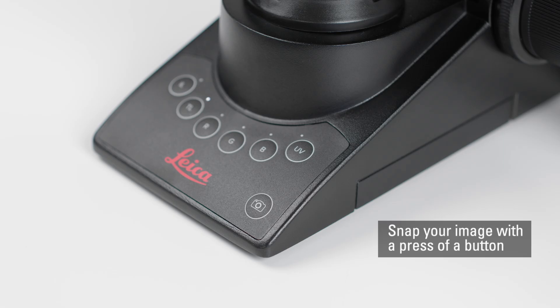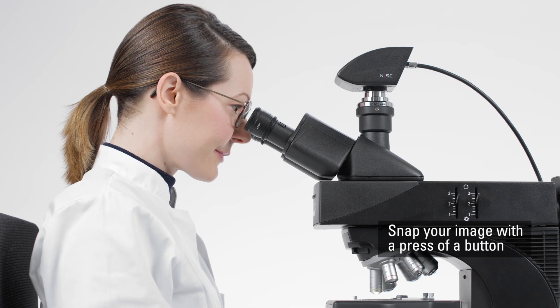Quickly capture specimen details with a press of a button while keeping your eyes on the image.